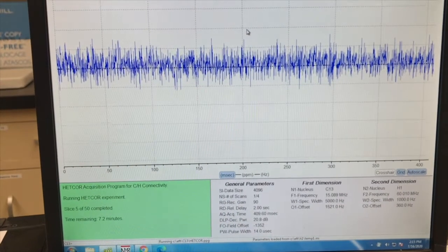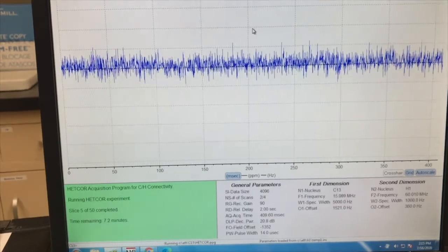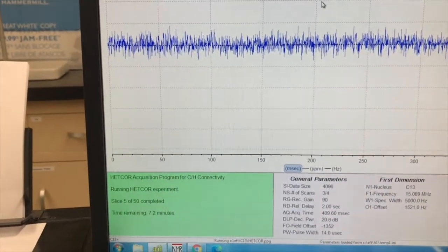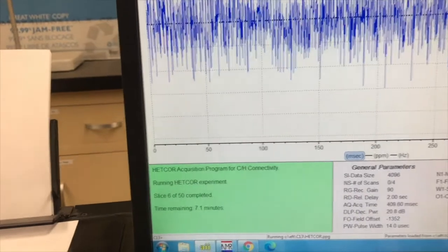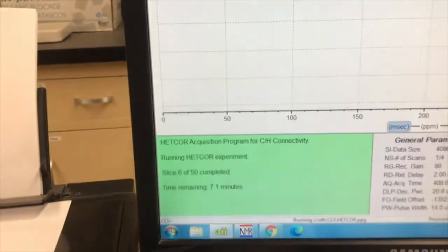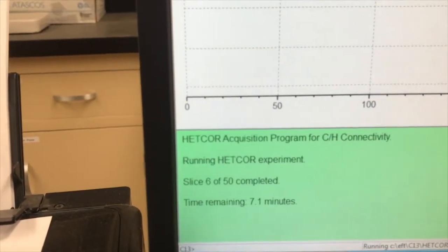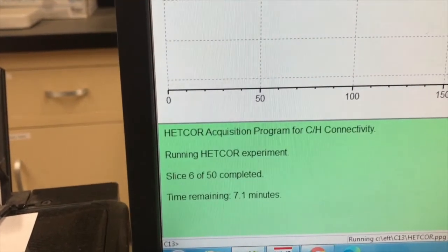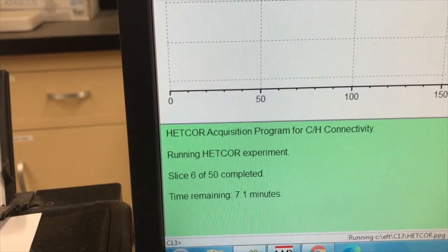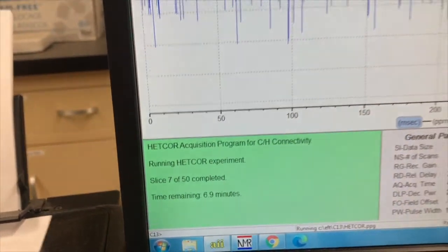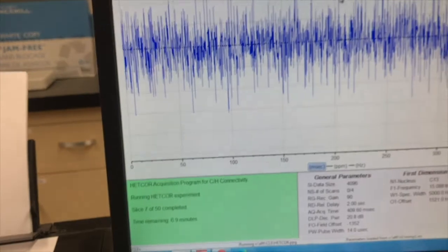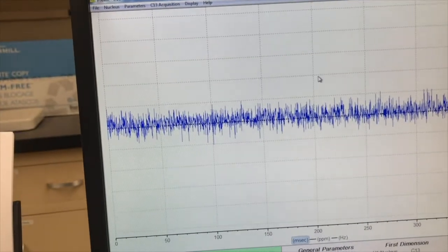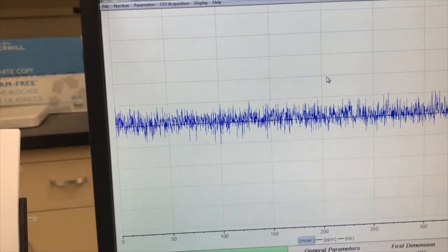I'm taking a HETCOR NMR — a two-dimensional NMR. We spent all this money on bottle service, so let's get all the spectra. Right now it's acquiring. It's getting six out of 50 slices, about seven minutes remaining. You can see the FID data pulsing on the screen.